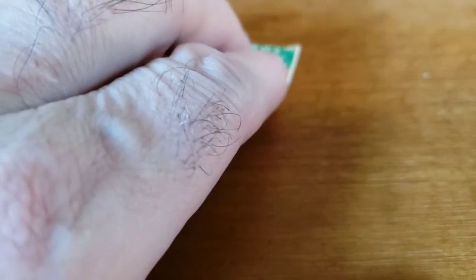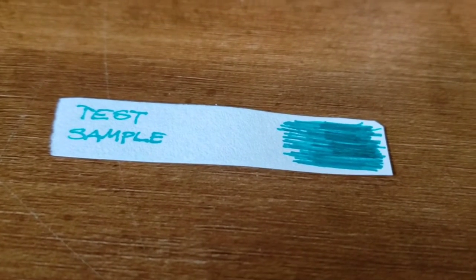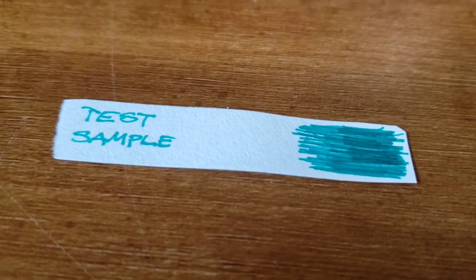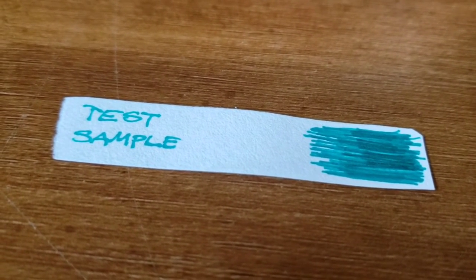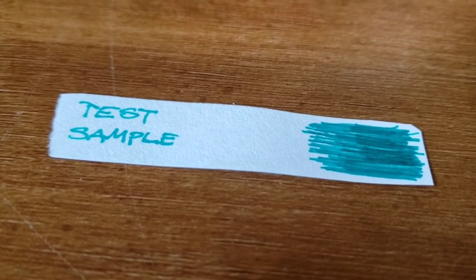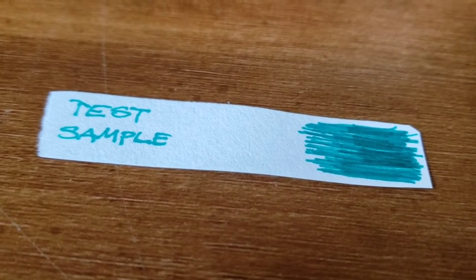So what I'm going to do is test that sample from the crime scene against something that I know the origins of, something that is my standard. This could be a paint sample from a manufacturer of a vehicle.